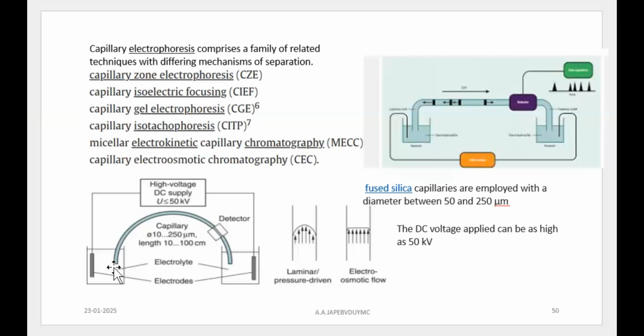Similarly here, the capillary electrophoretic system is attached to the analyzer systems. So whatever is happening at a given time will be monitored through that window, and that window is just monitoring the migration of the analytes, and that analyte migration is monitored or detected with the help of UV monitors, ultraviolet monitors.